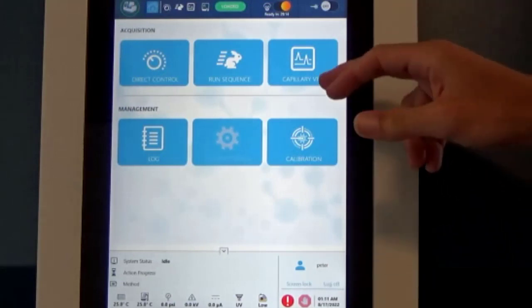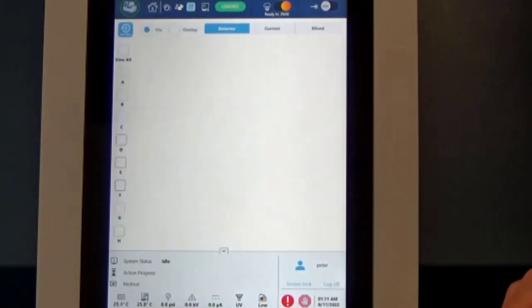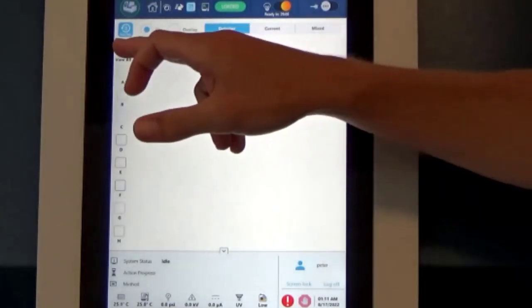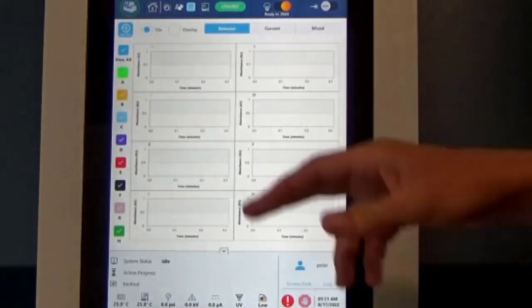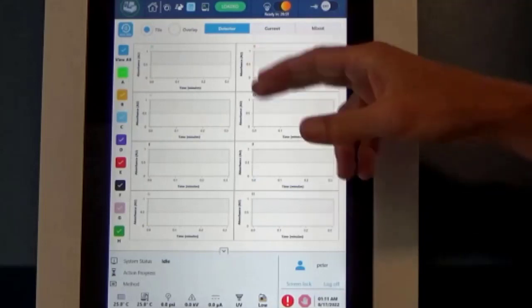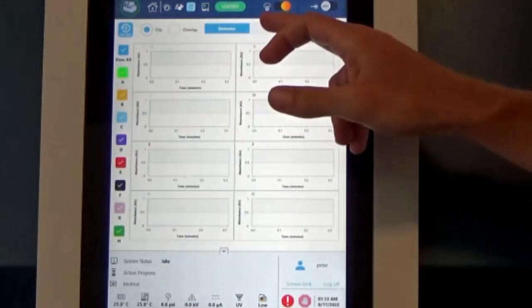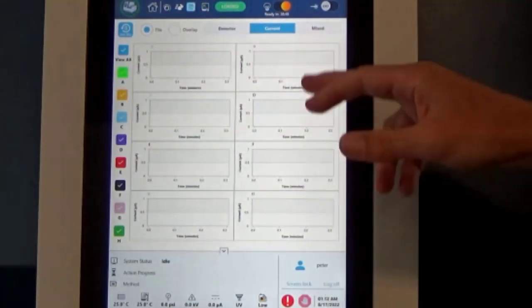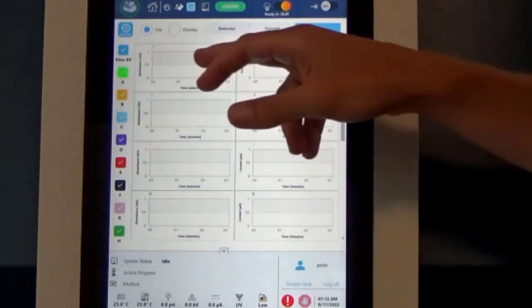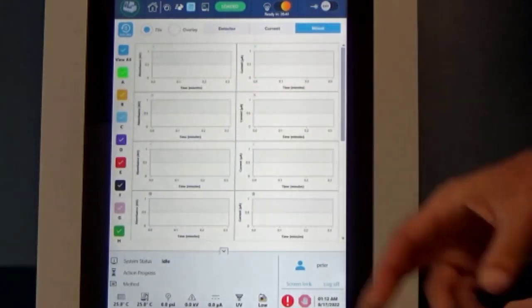And the last one we're going to take a look at here as far as tiles go is our capillary view. Click on that, go to view all. Here, as your run is going, you can see a real-time view of all 8 capillaries. These are all 8 individual independent capillaries. You can tile them here, you can overlay them into a single view, you can check out the generated current. You can go to a mixed view where you have your optical trace as well as your current trace if you so choose.